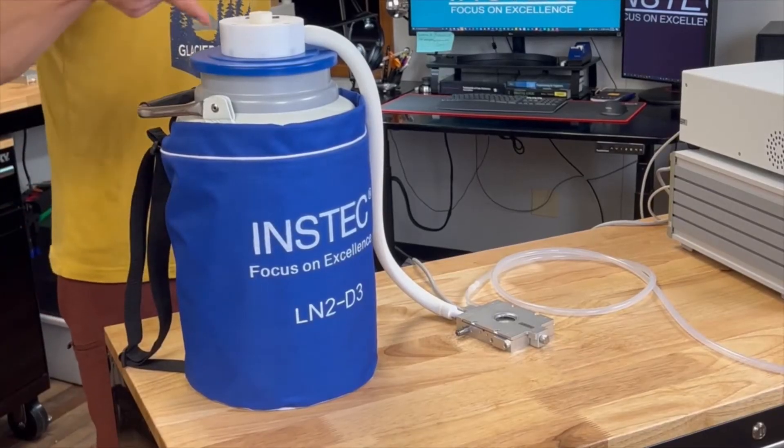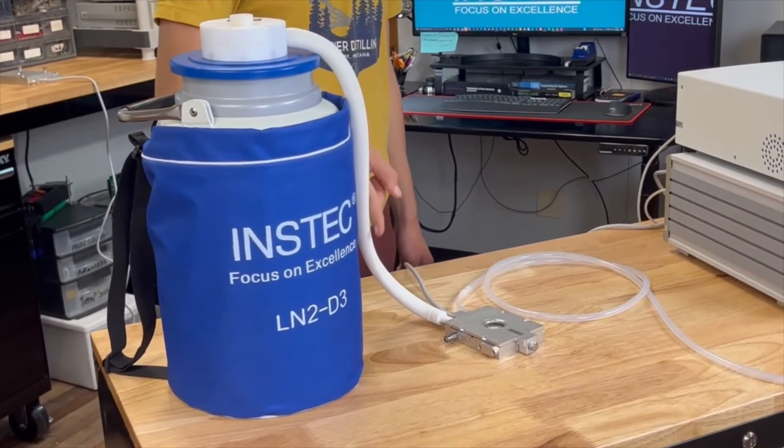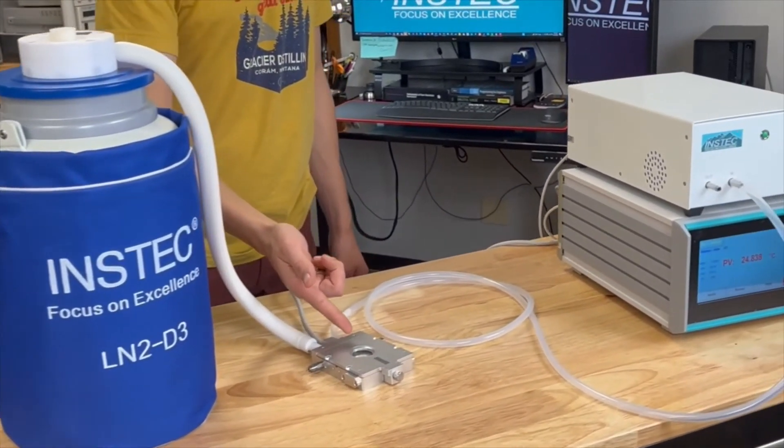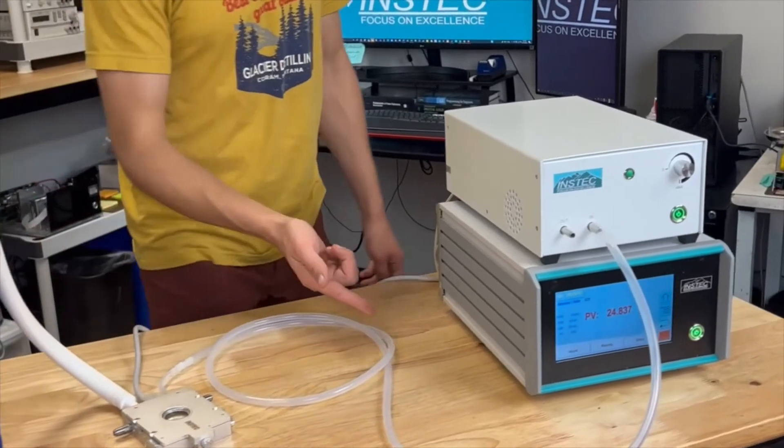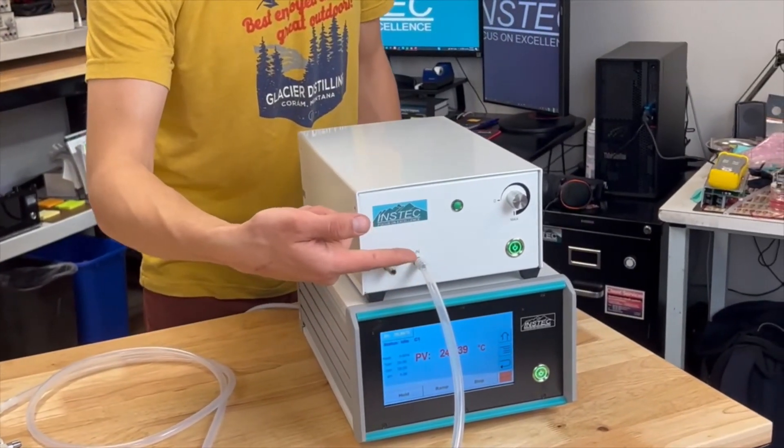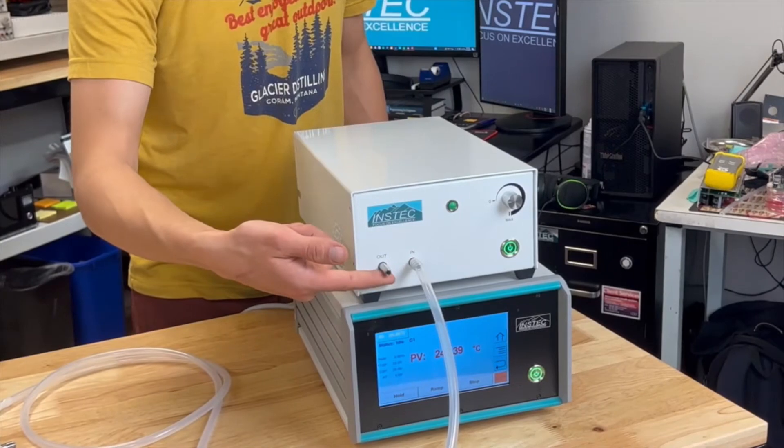The LN2 flow circuit begins at the insulated Dewar. It's pulled via negative pressure through the inlet tubing, into the sample area, through the outlet tubing, and to the LN2 suction pump. It is then heated and outputted as harmless N2 gas.